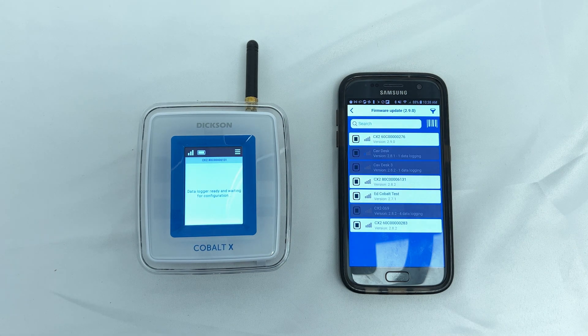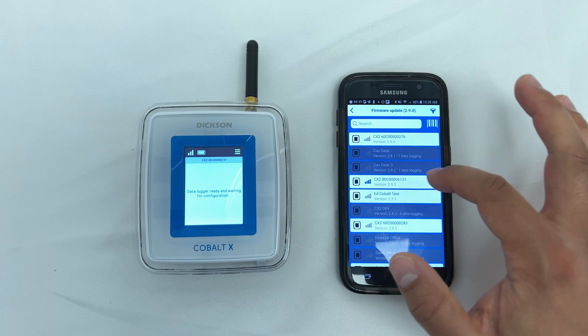Select the logger to be updated. The process of updating the firmware can take up to 20 minutes.